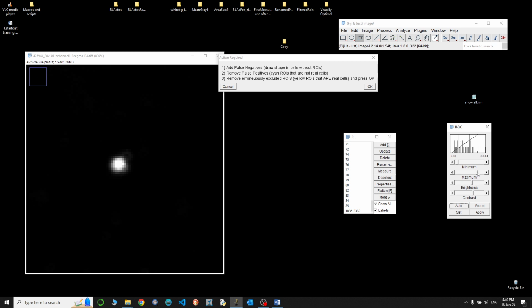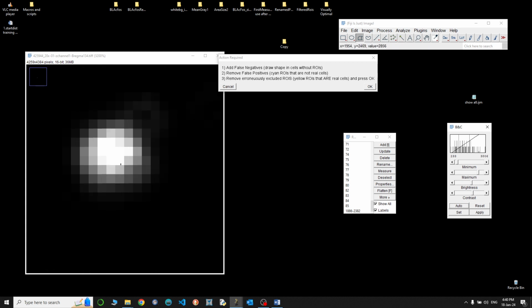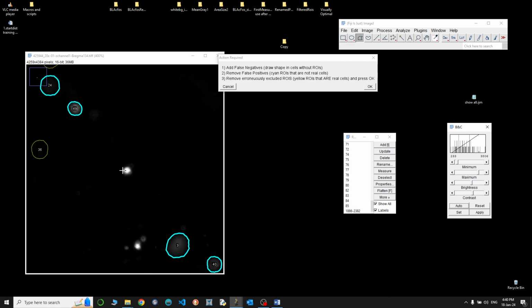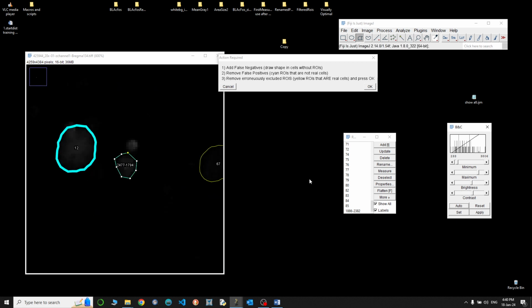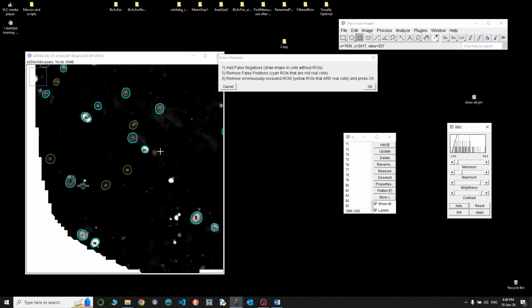When I go that low and I still see that there's a very tiny part of pixels occupying very high pixel values, then I suspect an artifact, all right, because I don't see the variance that I see, for example, here in terms of pixels, right? This is more realistic to be a nucleus.